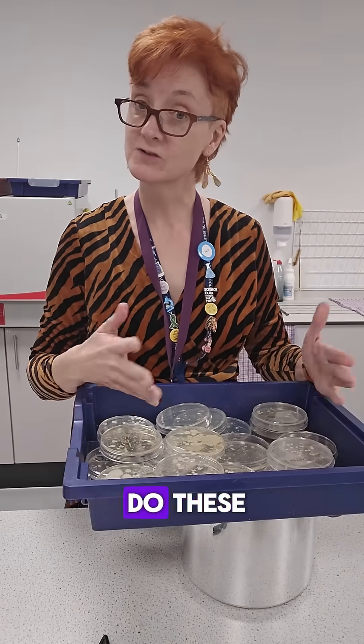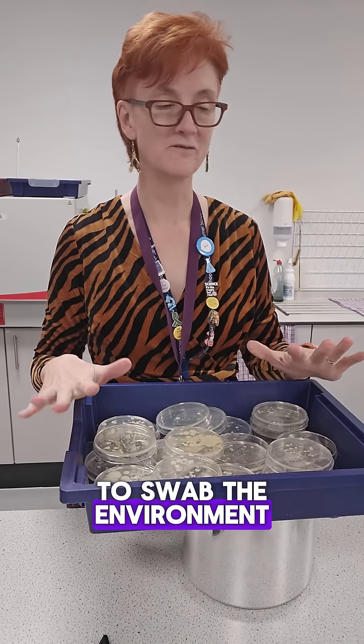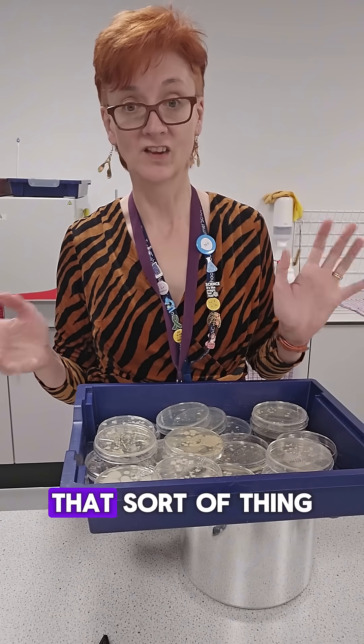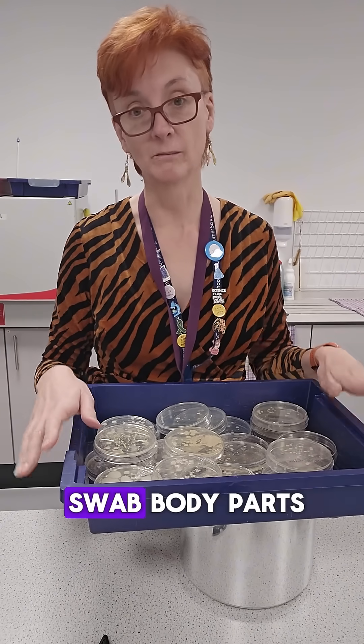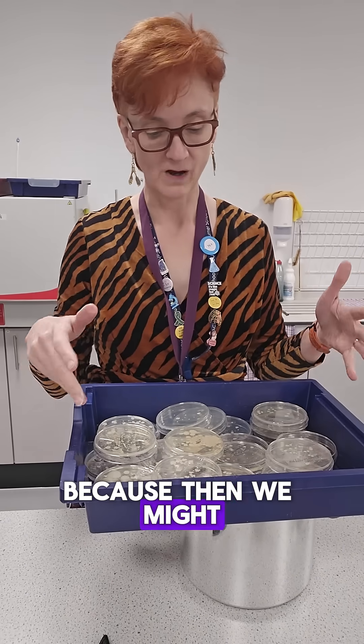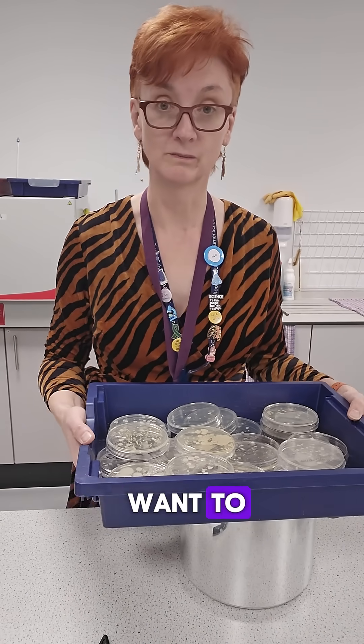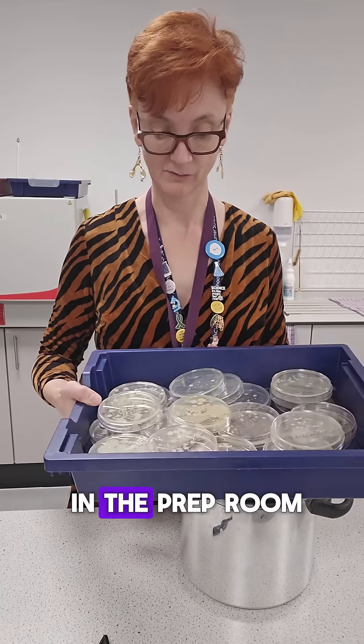I don't know what they swabbed to do these. Usually we ask them to swab the environment, like door handles, calculators, phones, that sort of thing. They're not supposed to swab body parts because then we might incubate some dangerous bugs. And we don't want to create superbugs in the prep room.